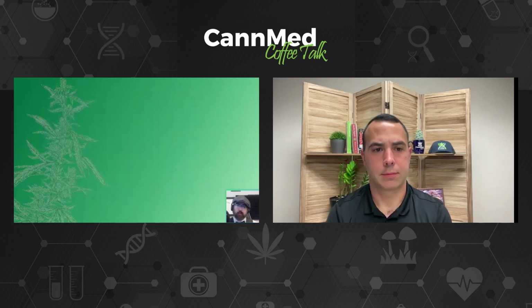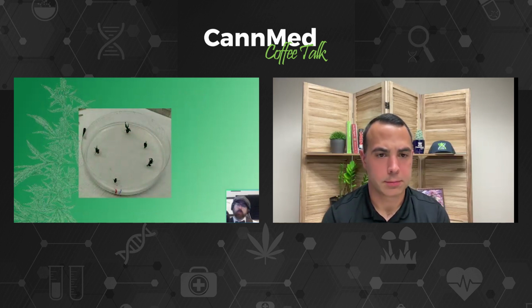This is from our lab currently. We're working with some of our partners and doing some work for them. So I took some cuttings off of one of their mother plants, and then selected for tissues, plated very small tissues. And these guys, what they start doing on that little jelly media that they grow in, they grow, they reproduce, they grow, they reproduce, they get bigger, they reproduce, and more.